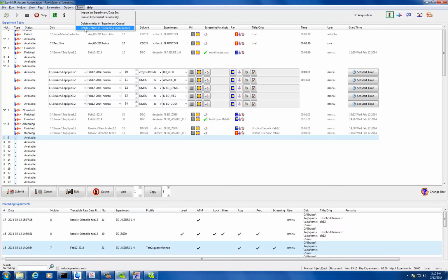How much time does it take? Do you have a 4 or 5 digit balance? For the ursolic acid method, he said it was 10 minutes, maybe 15, something like that. So that's definitely one way. We need to weigh out the standard as much as we can weigh accurately. I don't think we can weigh out 2 milligrams, but what we buy is a 5 milligram bottle.